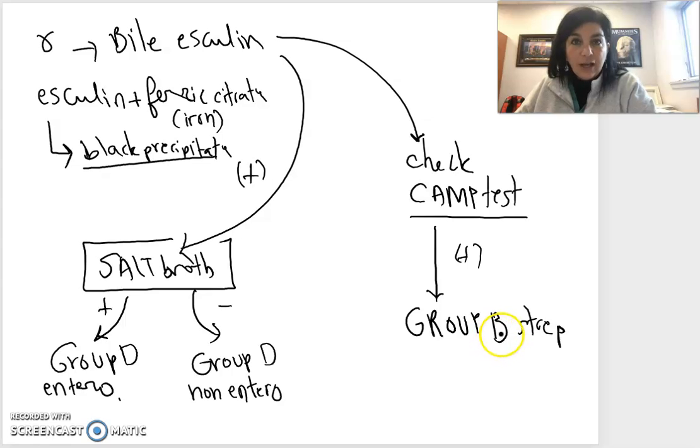Well, we actually have group B gamma hemolytic cells, and we can only really see that if we also do the CAMP test. These group B strep cells have the CAMP factor, and that's really what allows us to pull out these group B cells. But in this case, they're group B cells that have a gamma hemolytic property.